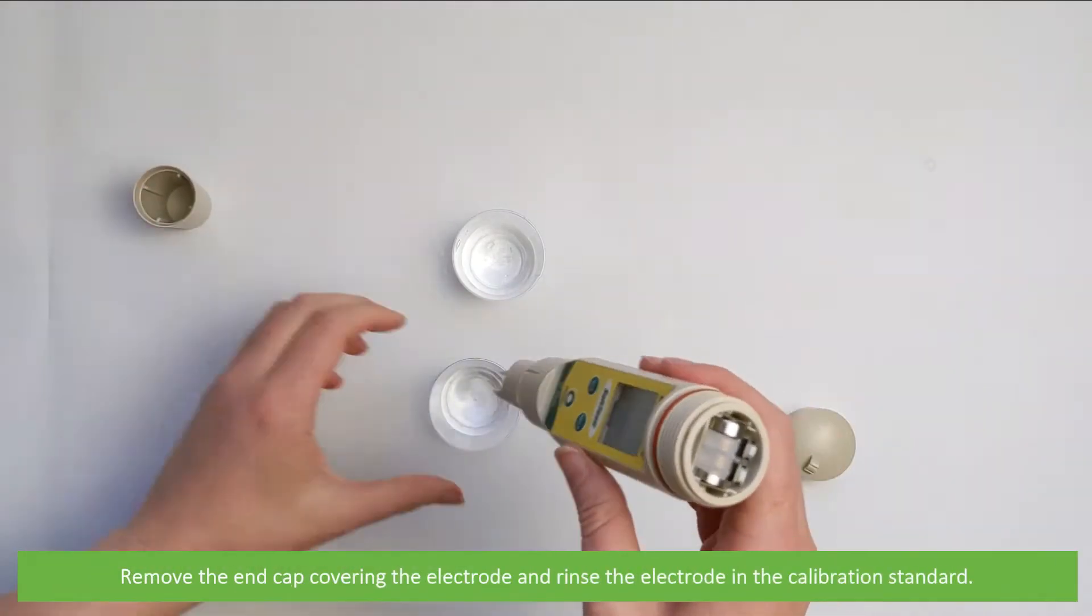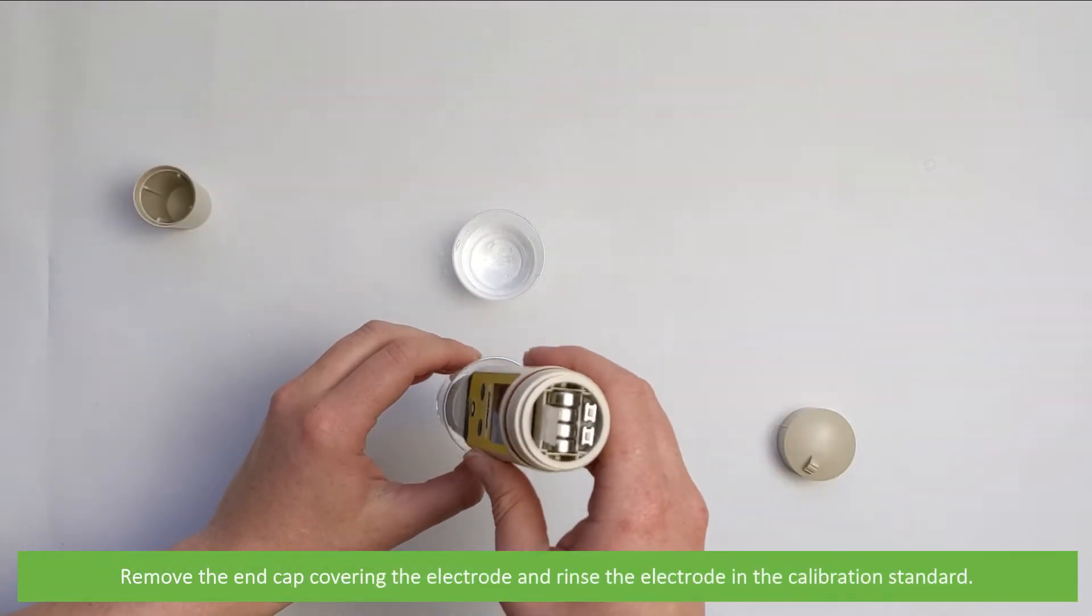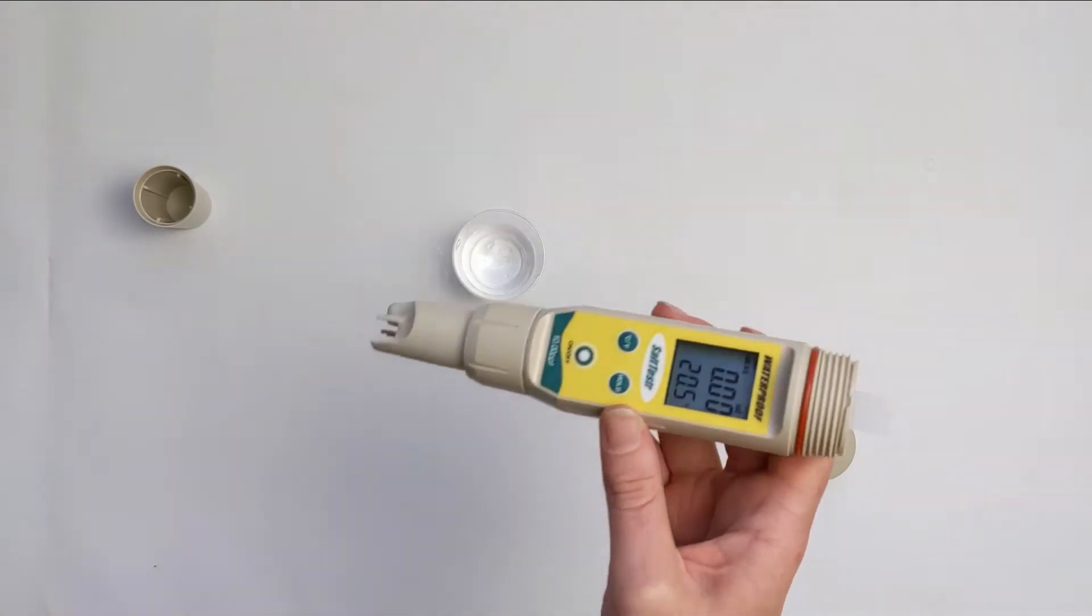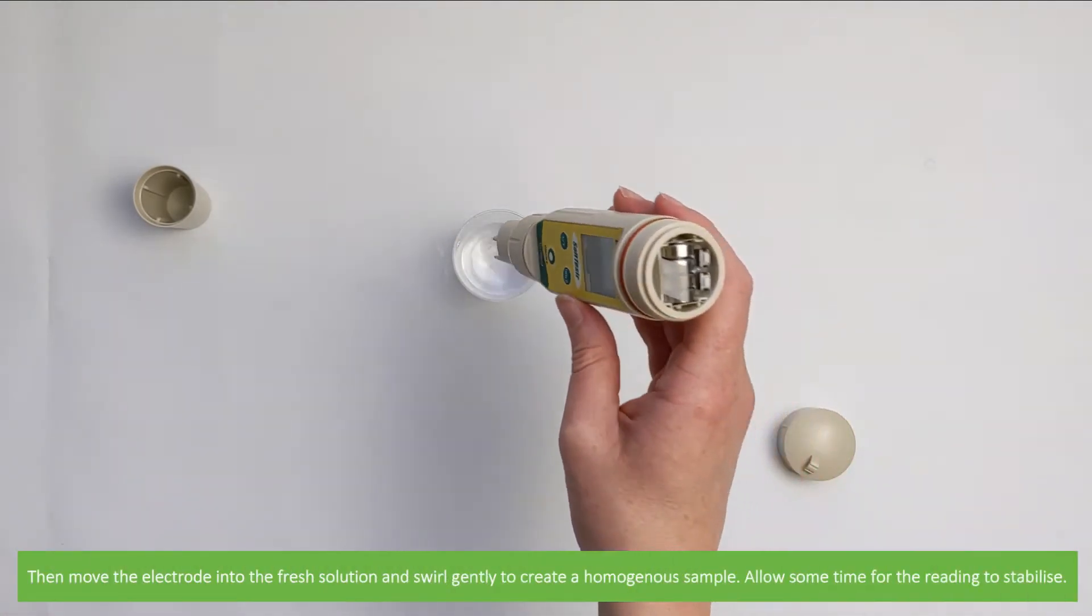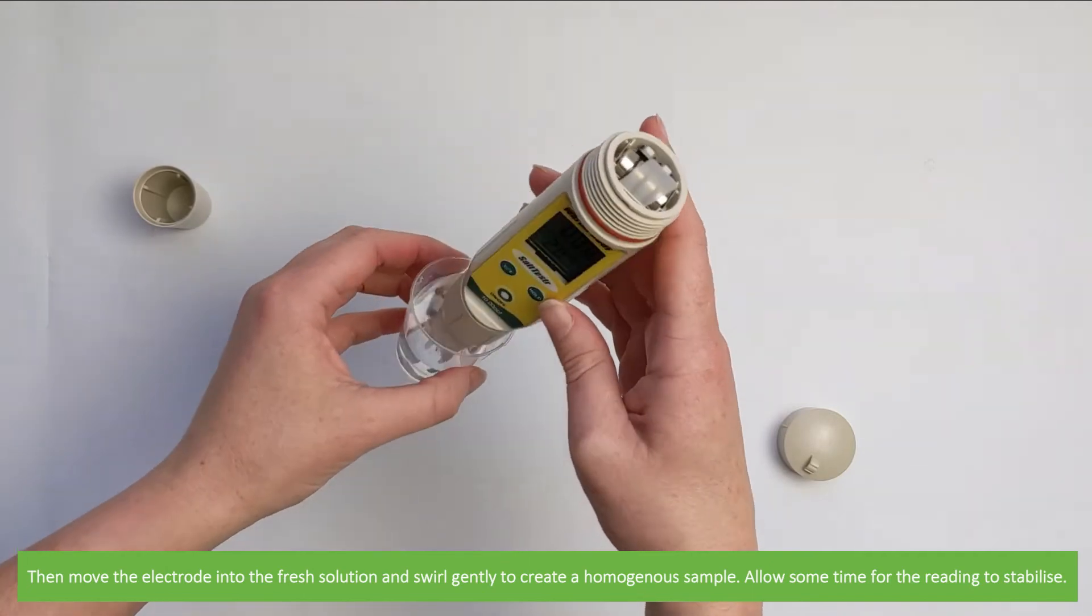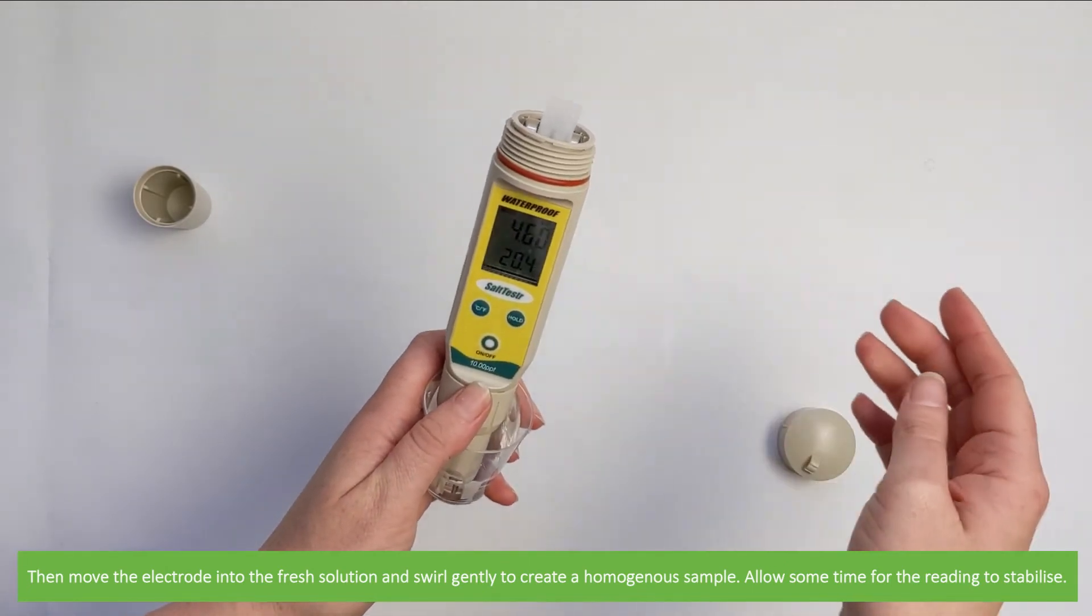Remove the end cap covering the electrode and rinse the electrode in calibration standard. Then move the electrode onto the fresh solution and swirl gently to create a homogenous sample. Allow some time for the reading to stabilize.